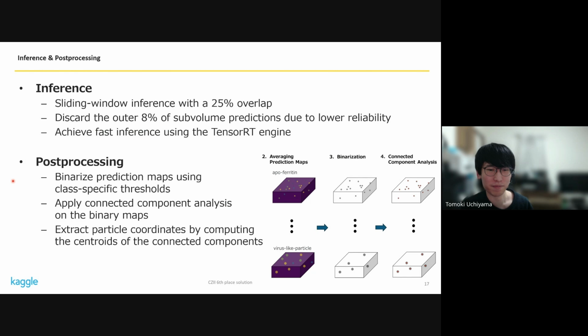And for post-processing, I binarize the prediction maps using class-specific thresholds. And then I apply connected component analysis on the binary maps. And finally, I extract particle coordinates by computing the centroids of the connected components.